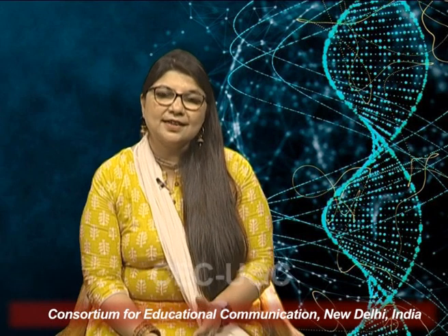So these are some of the applications of NGS platforms, which, as I said, have revolutionized the biotechnology sector. They have revolutionized the way we understand DNA, RNA and the functioning of cells, and the development of newer and newer techniques is making this technology much more advanced and better for commercial uses.